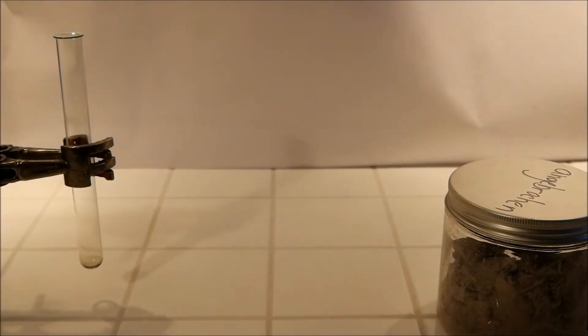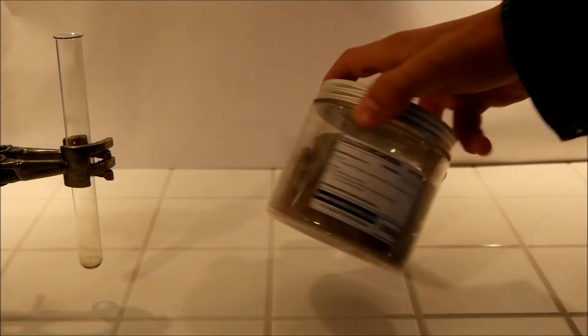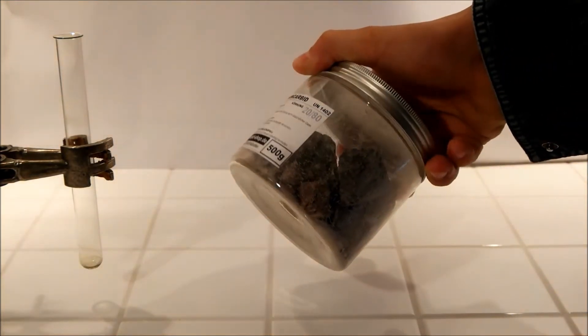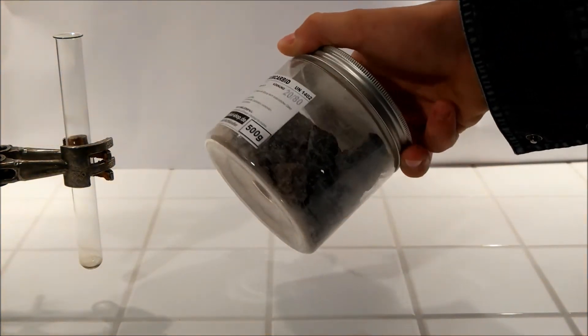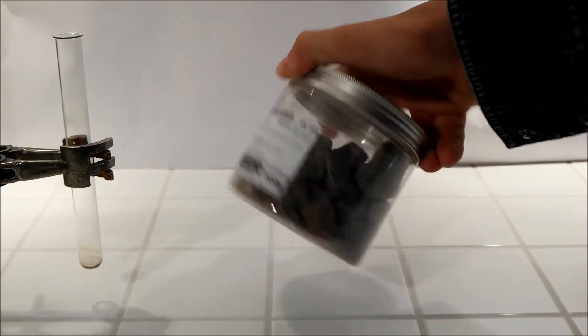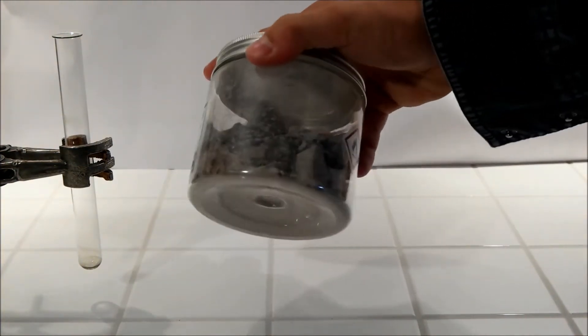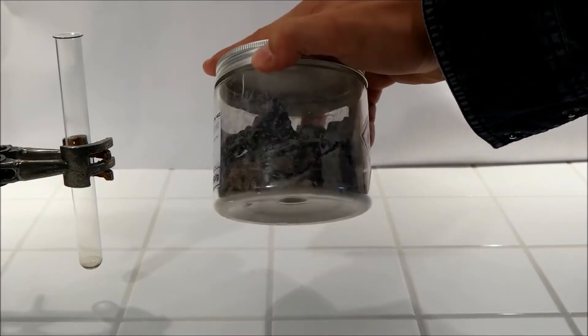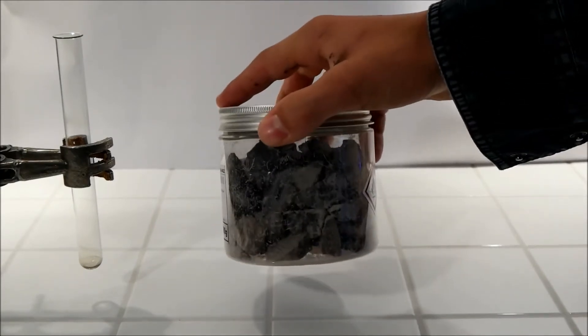But first I want to show you something else. So this calcium carbide is normally white crystals but I could only buy it in those grey chunks or in those nuggets.